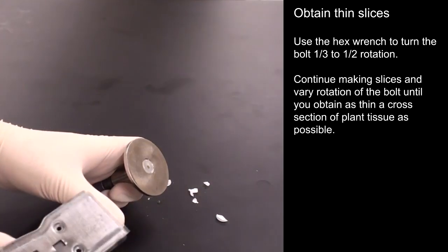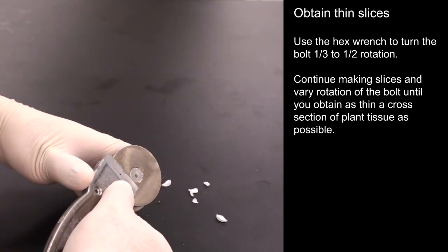Continue making slices and vary the rotation of the bolt until you obtain as thin a cross section of plant tissue as possible.